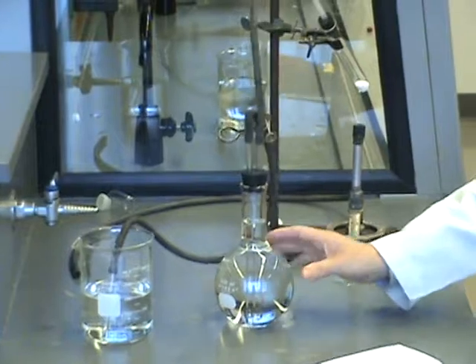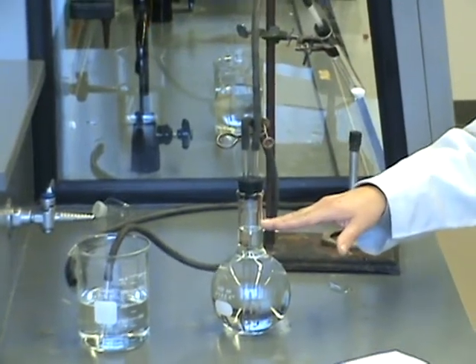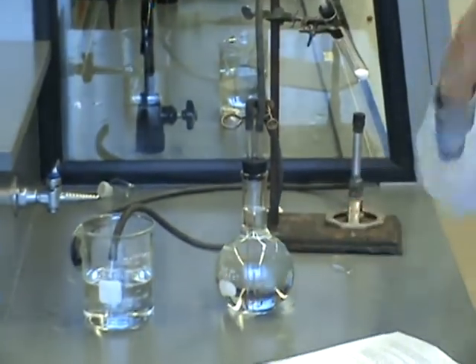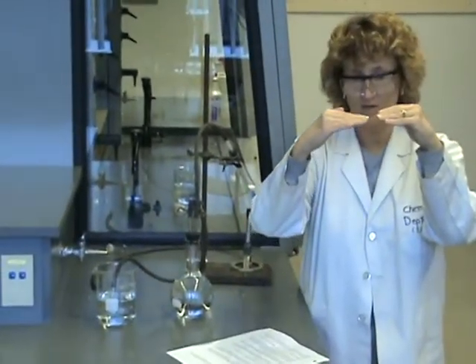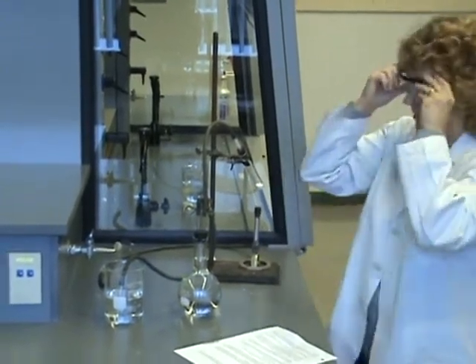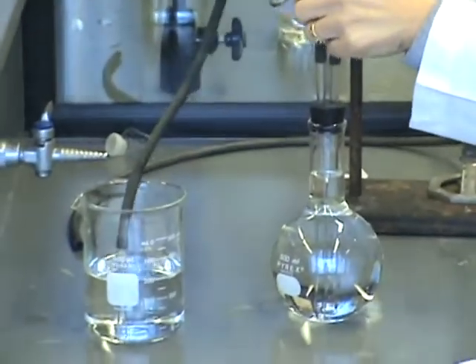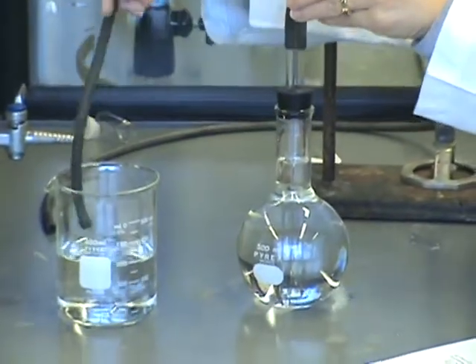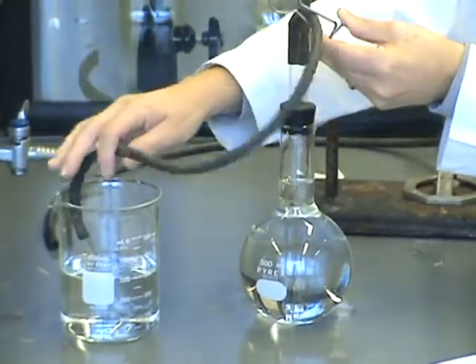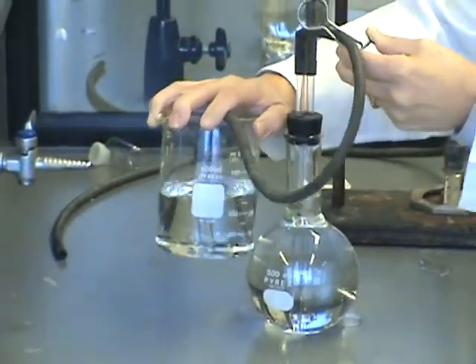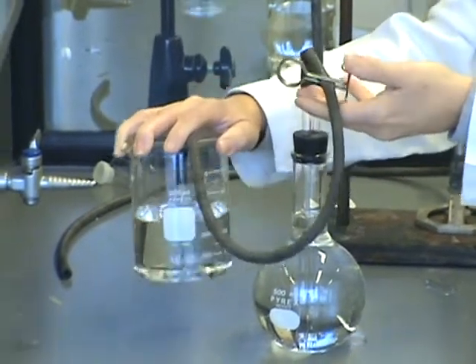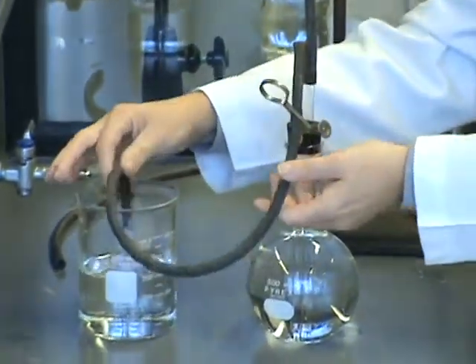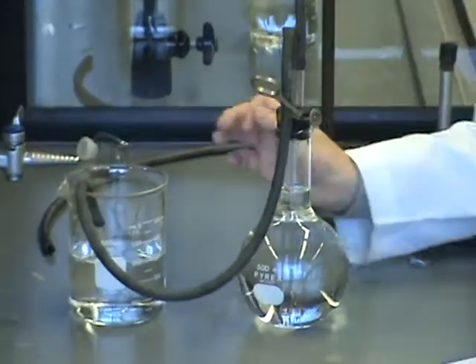I'm going to raise that beaker up so the water levels line up, and then I'm going to shut that clamp at that moment. So here we go. So I am opening the clamp to allow water flow. I'm going to hold that beaker up here. I just eyeball it, line them up visually, and I reclose the clamp. That was step seven.